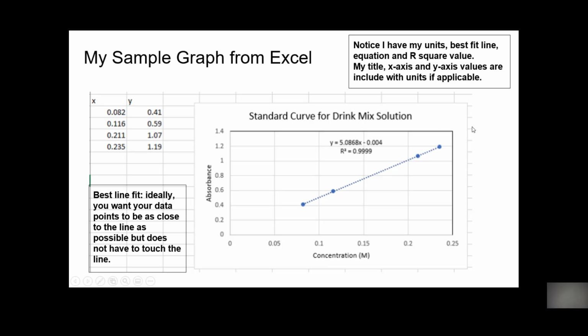When you have your data values, and you will know which ones they are, LabFlow will walk you through everything. You're going to graph. I used Excel, but I tend to use Google. What is it? Google Docs? No, Google Sheets. I tend to use Google stuff. But what I found is that when I try to use this stuff on PowerPoint, it doesn't come out well. Or at least I don't know what I'm doing.